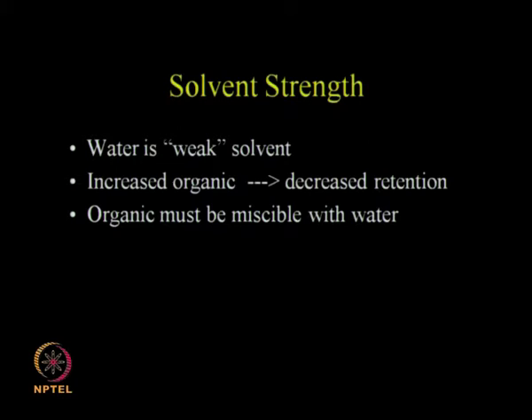Solvent strength: water is a very weak solvent, so as you keep increasing the organic, there is a decreased retention. The organic must be miscible with water, that means whatever organic solvent you select should be miscible with water. So if we keep increasing the organic content, then the retention keeps going down because it is changing the hydrophobic nature of the continuous phase.